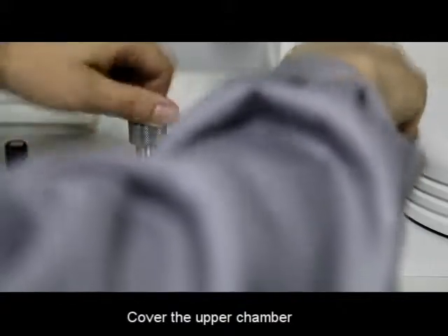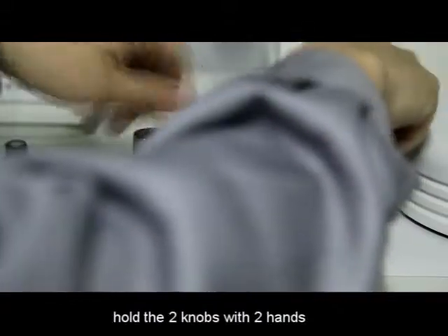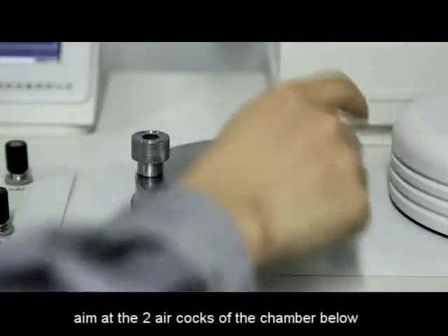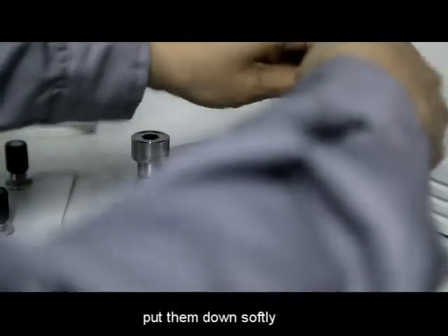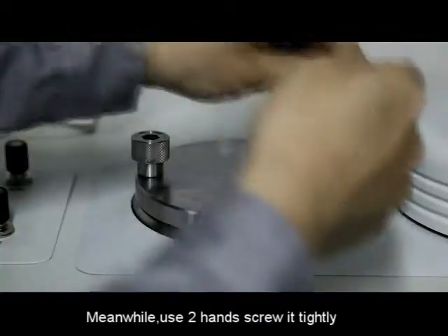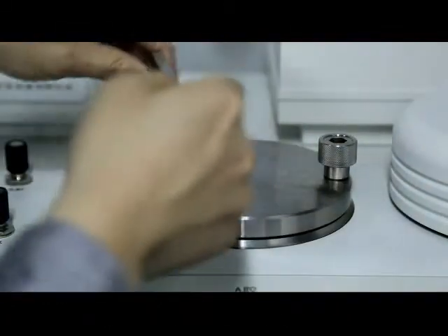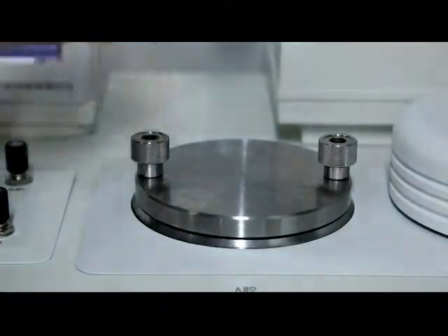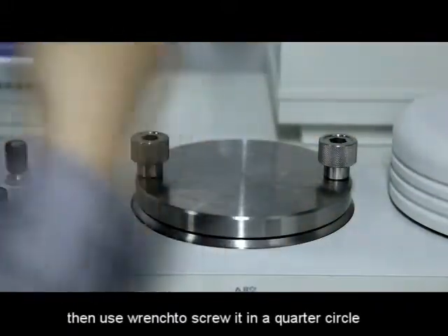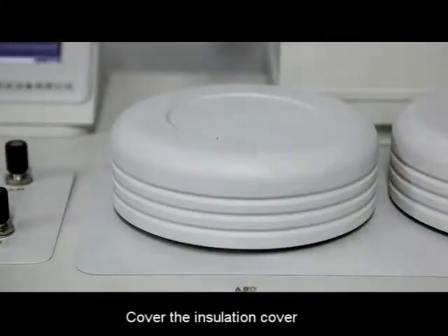Put the copper plate carefully on the chamber. Cover the upper chamber, holding the two knobs with both hands. Aim at the two air cocks of the chamber below and put them down softly. Meanwhile, use both hands to screw it tightly, then screw it an additional quarter circle. Then cover the insulation cover.